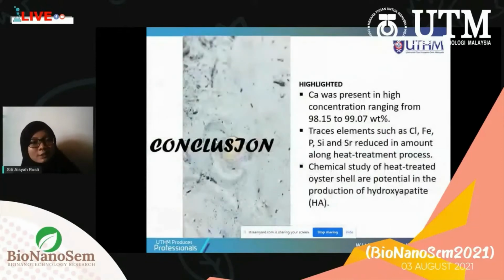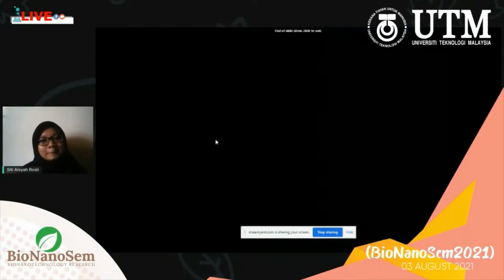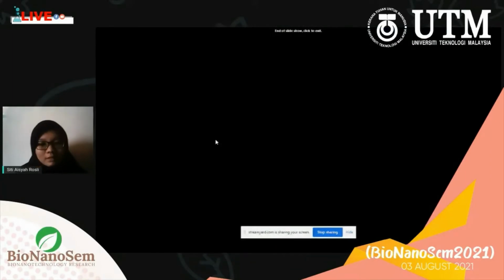So I would like to conclude that the calcium content in our Crassostrea bilineata is quite higher compared to our previous study, and the trace elements show some reduction in amount along the heat treatment process. So in this study, the chemical composition in our shells has potential in the production of hydroxyapatite. That's all from me.